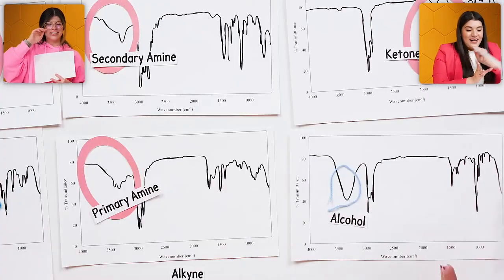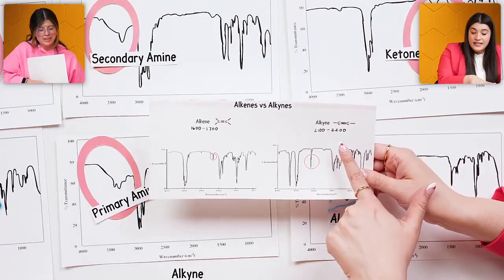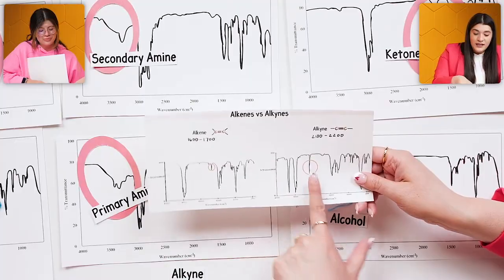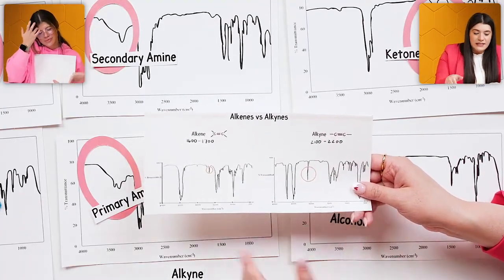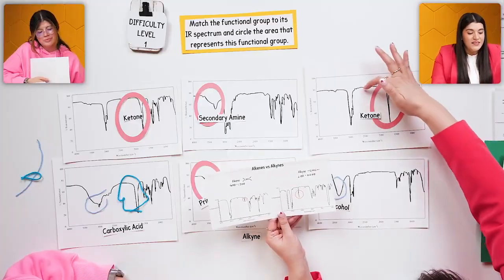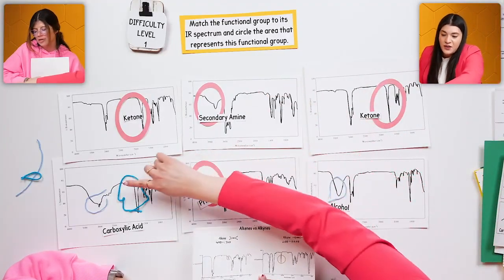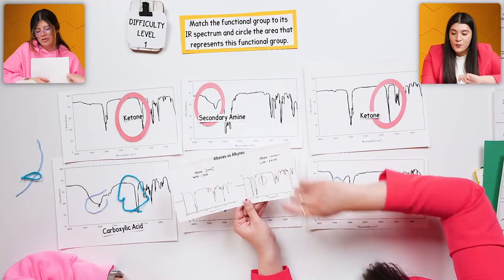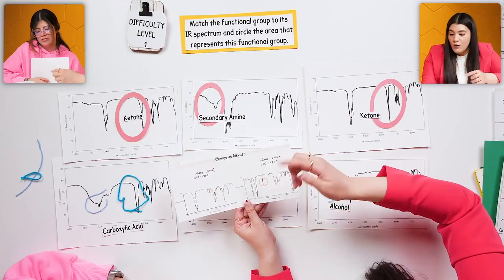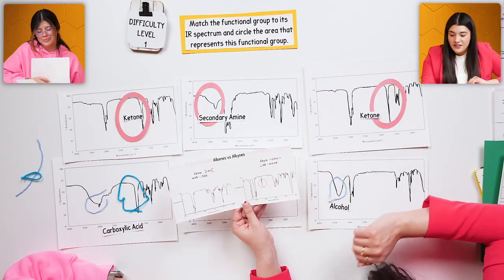Okay, that's perfect. And then just in case, just so you know, the difference is, if this was an alkyne, there would have been a peak within this region, so I'd say roughly 2100 to 2200. And there's nothing there, right? There's nothing here, it just keeps going. We would actually have a sharper or more narrow peak that would show there. Same with an alkene. But no, we don't have that, so that's out.